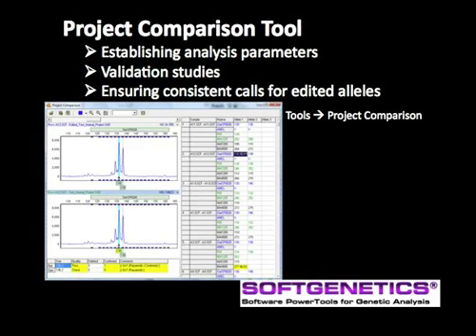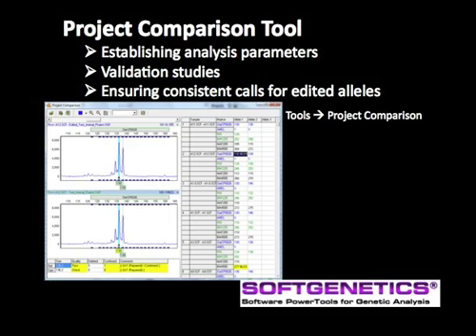The Project Comparison is a review tool that provides a fast, side-by-side comparison of two replicate projects. Uses include establishing and comparing analysis parameters, validation studies to develop laboratory standard operating procedures, and ensuring consistent calls of edited alleles.